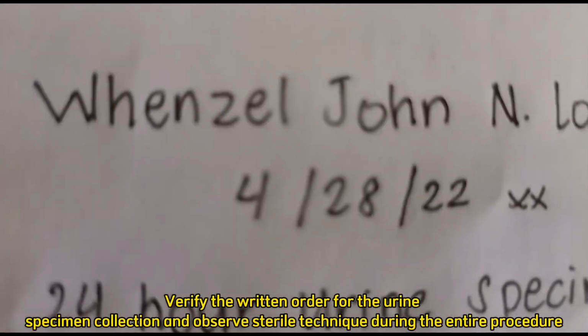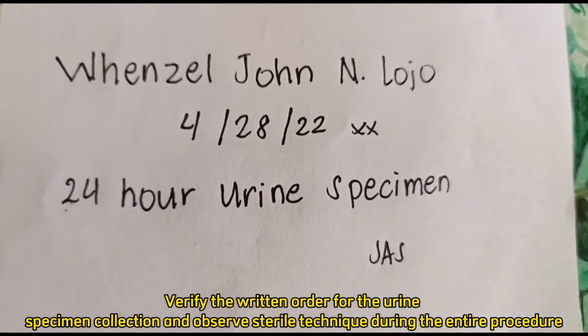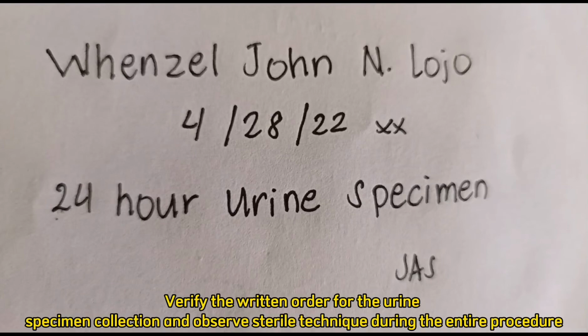To avoid the container being replaced, you need to label the container with the patient's name, current date, and identify the specimen as a 24-hour urine specimen. And don't forget to include your initials.